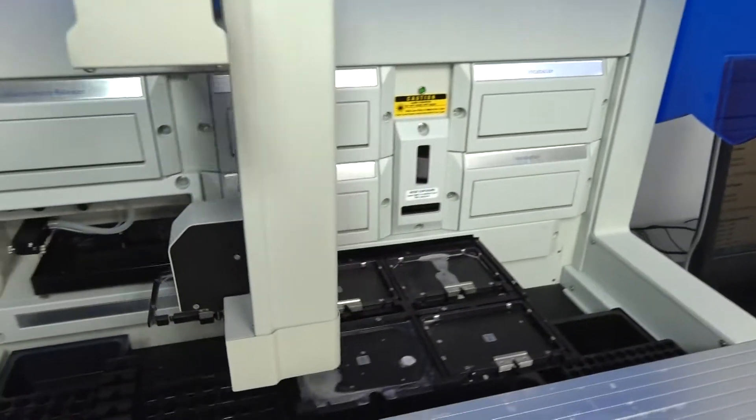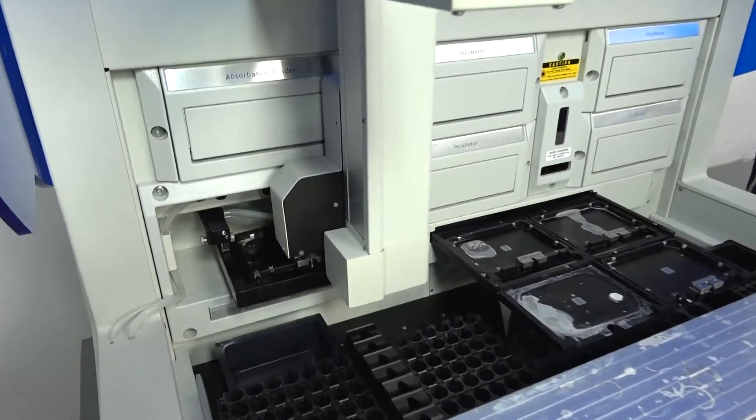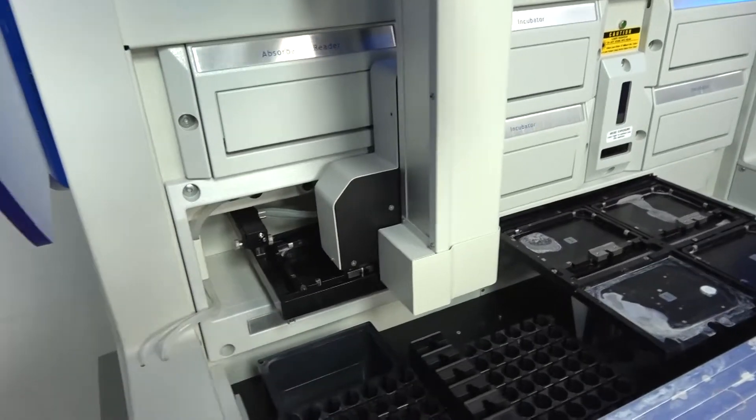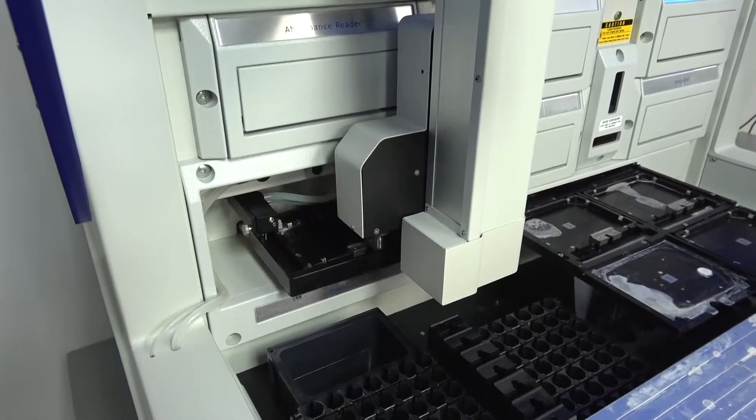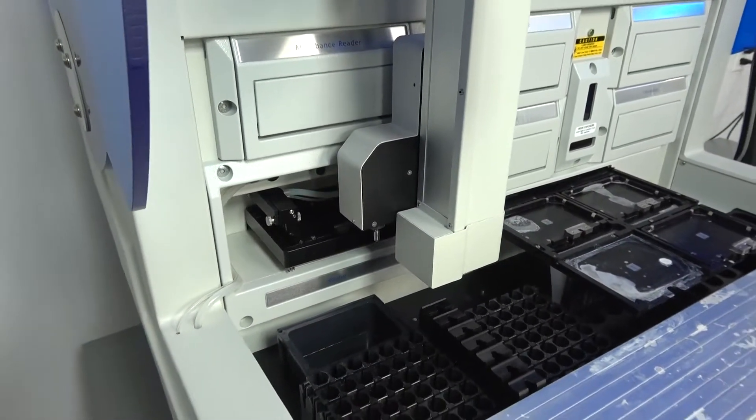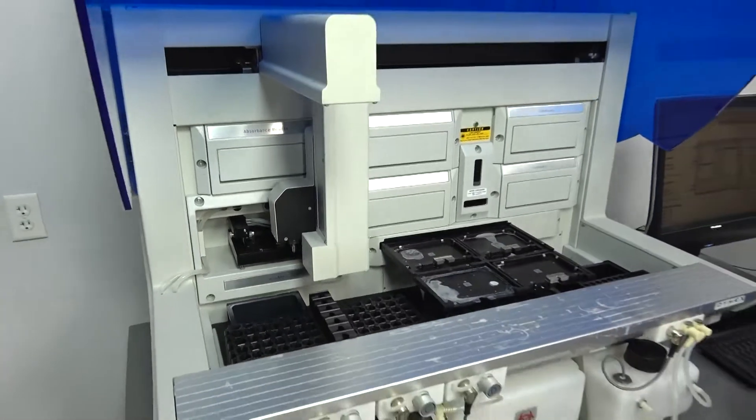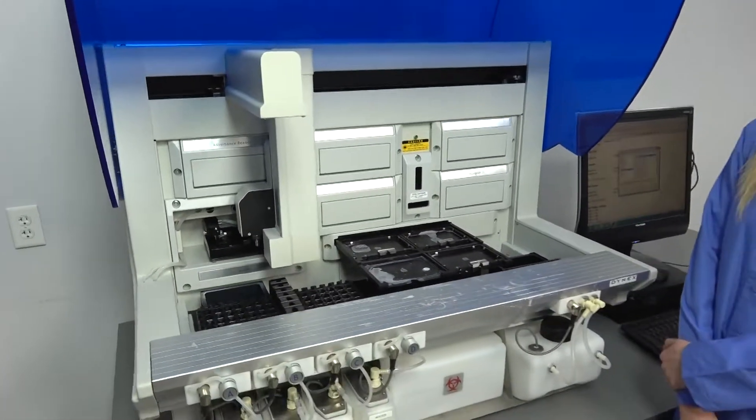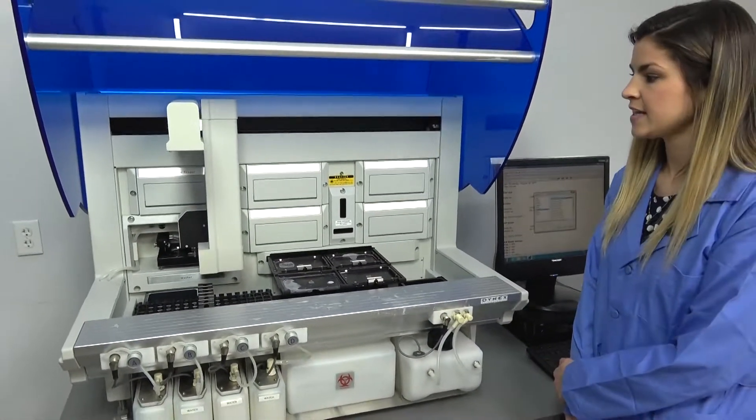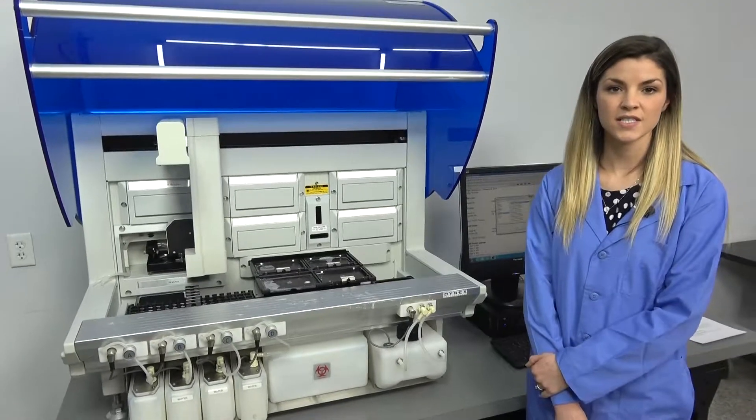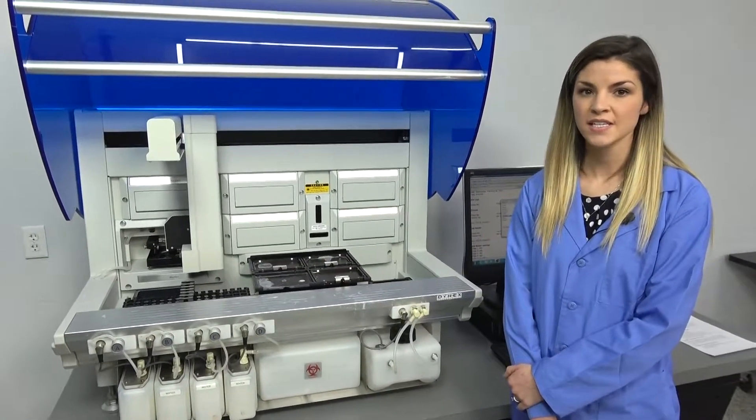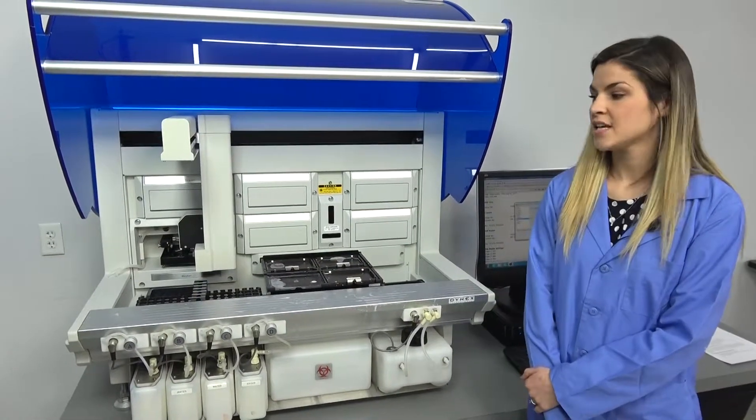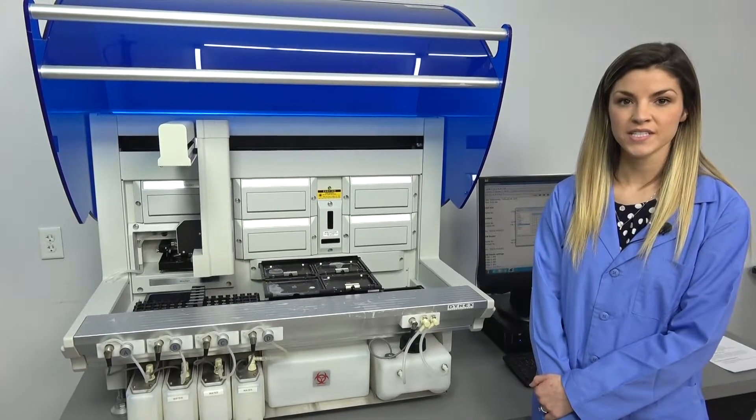So now it's going to move down to the wash station and place the plate in the wash station. So as you can see, this has really nice functionality with this unit. And like I said, it's been tested by our technicians here in the Credersville facility. And we back this by our 90-day warranty.